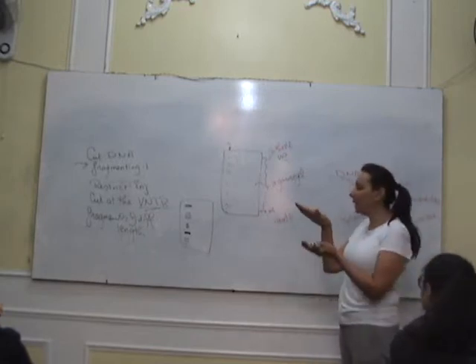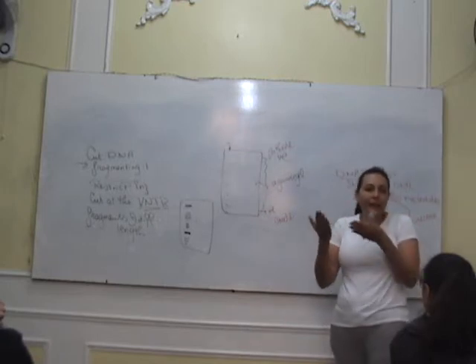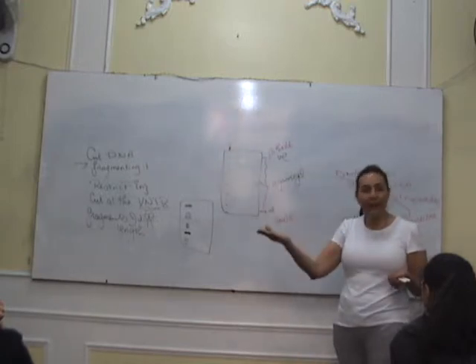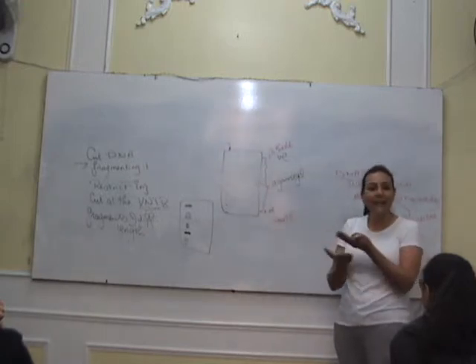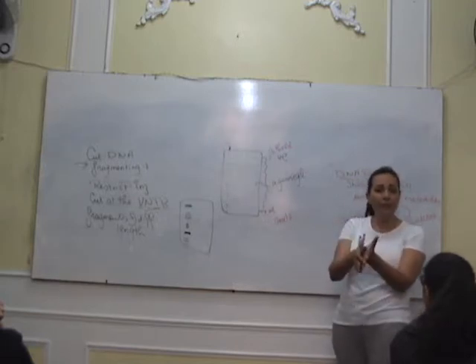Paper to separate the strands. Do you start the copy, or do you have to make the electrophoresis? I'm going to put the electrophoresis on paper and I heat the paper. Actually, you get an extra mark and then you put it on paper. If you put the paper and you put the heating directly on the electrophoresis to separate the strands, you get the mark for separating the strands.